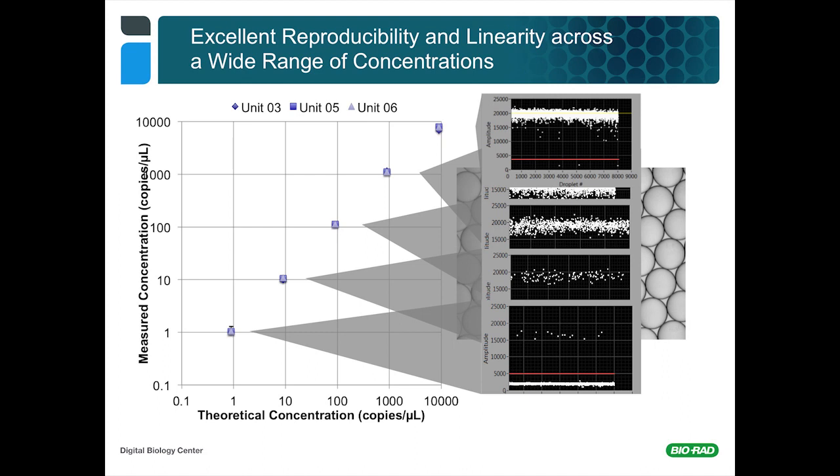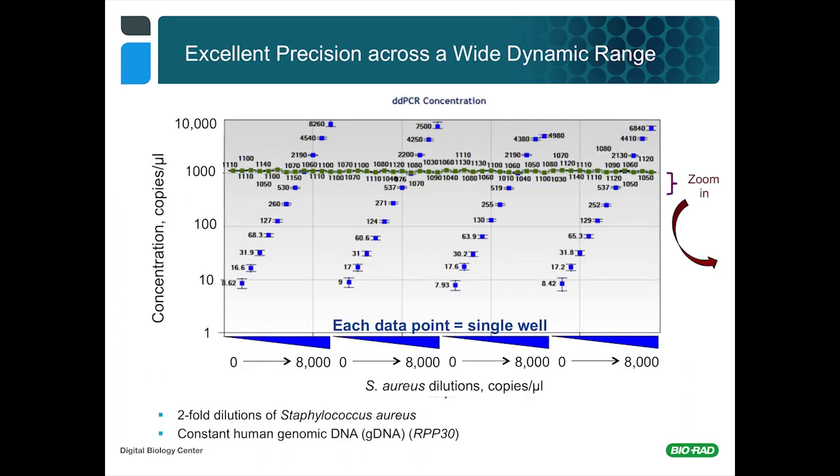And what you may not appreciate is that there are actually 95% confidence intervals on each of those markers, and this was done on 3 different instruments. The markers are superimposed from the measurements made on 3 different systems, and they're completely superimposable. That's sort of an older view of the data.